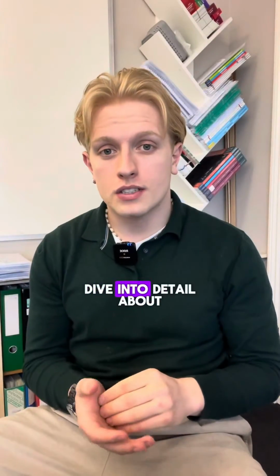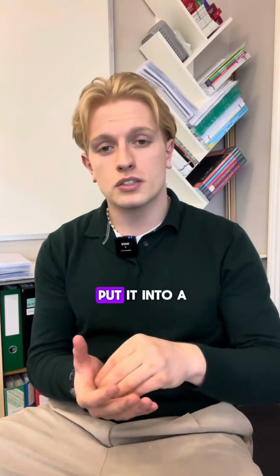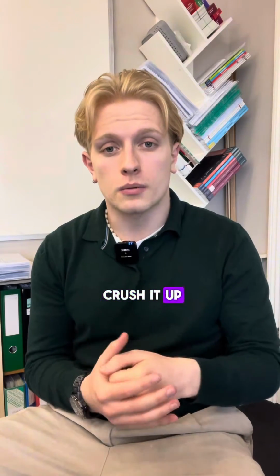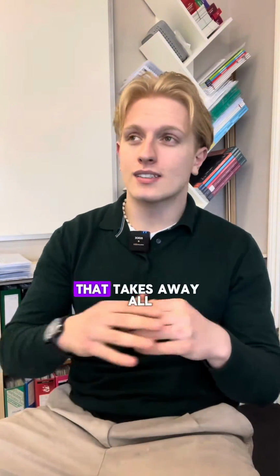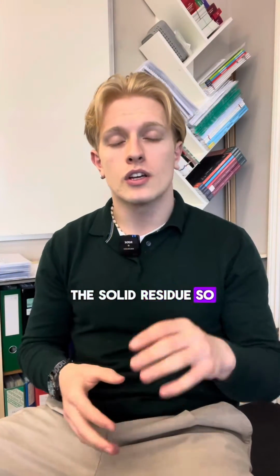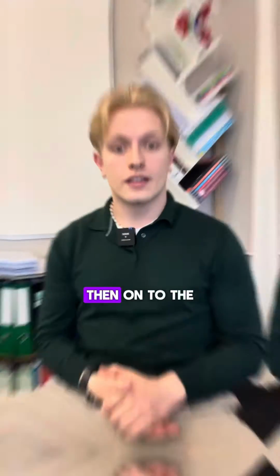If you have to dive into detail about the method, they all start in the exact same way. Take your food substance, put it into a pestle and mortar and crush it up. After your food sample's crushed, mix it in with some water and then filter that substance. That takes away all the solid residue so that the colour changes which the food tests depend on do not get distorted. Then on to the tests.